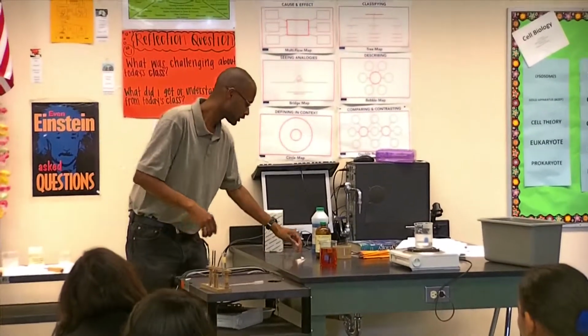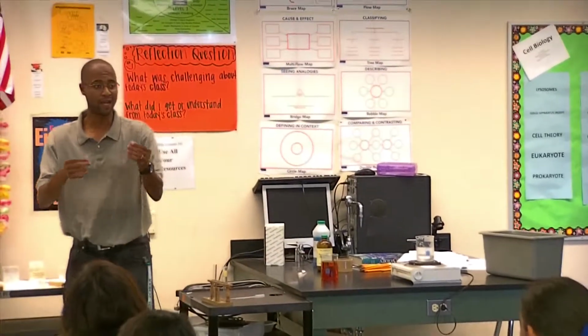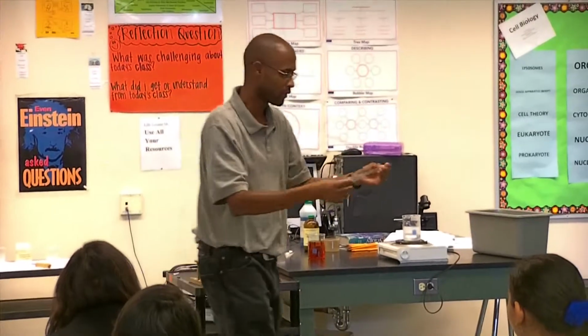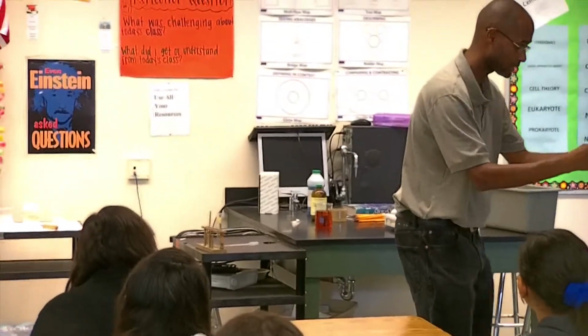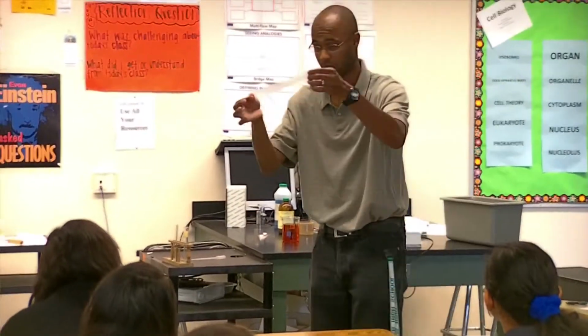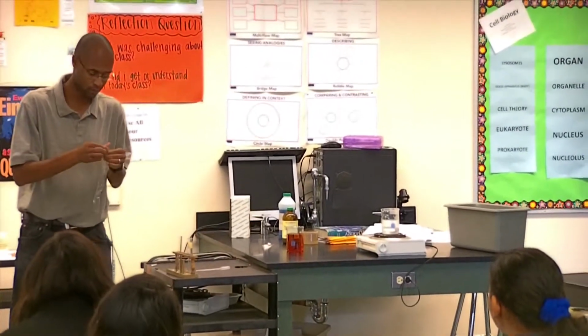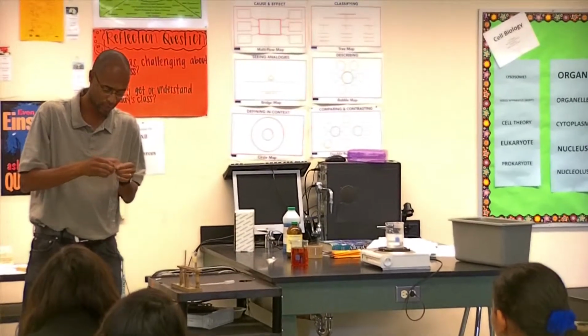Today's lab is a diffusion lab. We're using what is called dialysis tubing. If you look at this, there's no hole, it's not taped, there are no holes in here at all. The biggest challenge is trying to get this thing to open up. Let's see if we can work this out.